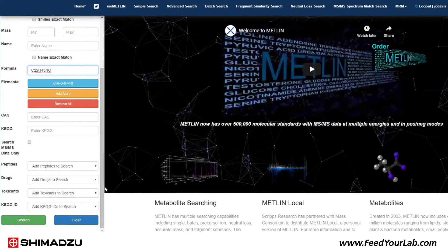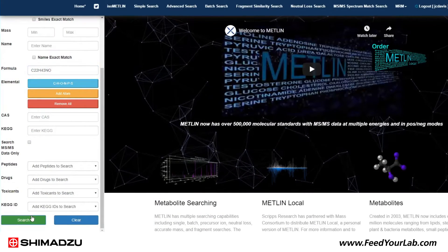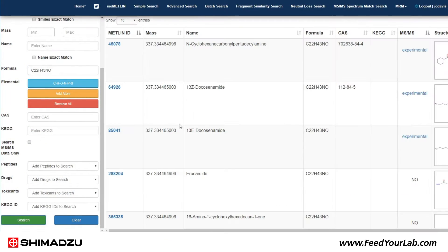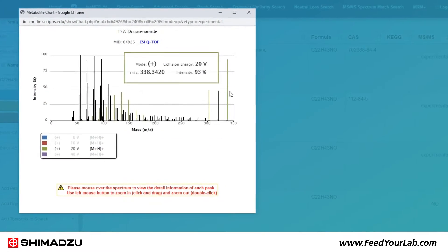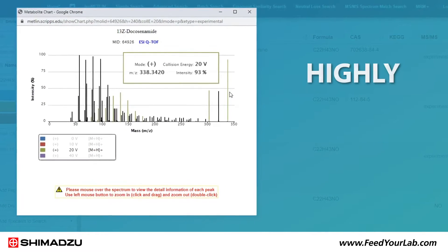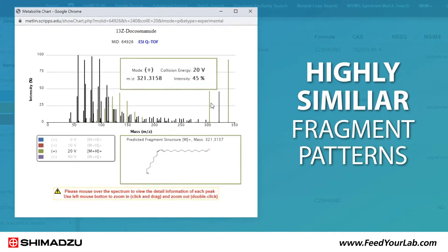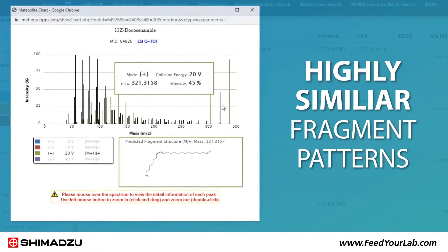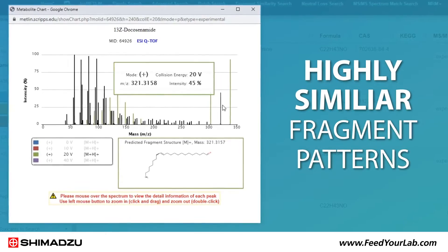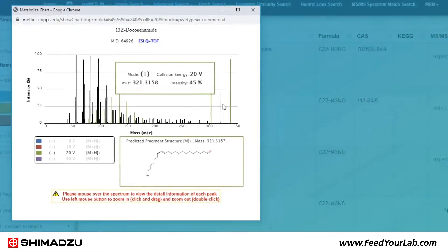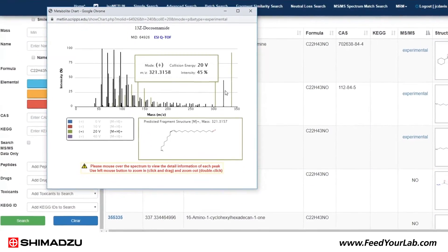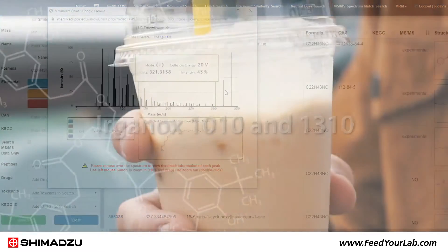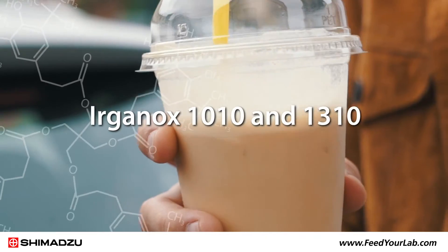We then compared the fragmentation data to the METLIN-MS/MS library for further confirmation. We found highly similar fragment patterns between experimental unknowns and the database, which further supports the identification results.